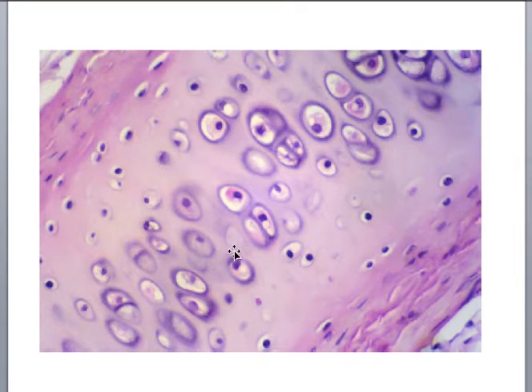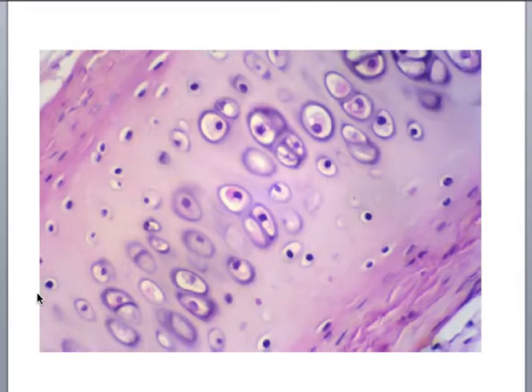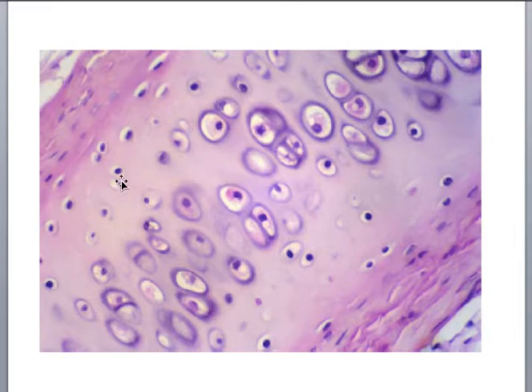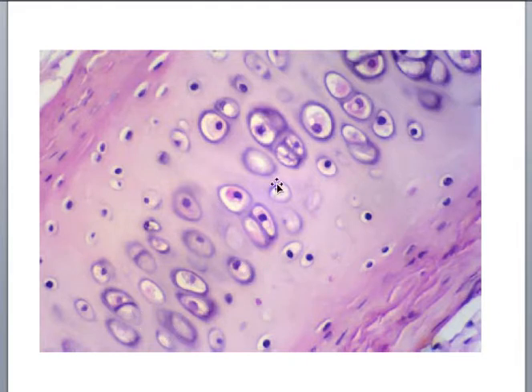This is another image of hyaline cartilage, and this is why you can't always learn by color or stain — because the stains and colors can vary, but the structure is not. Here are our chondrocytes in their little lacunae. If we could go in and out of fine focus, this extracellular ground substance would be very, very glassy in appearance. On the outside is that vascularized connective tissue — the perichondrium. All the structures are the same; the colors are slightly different. Usually no one gets hyaline cartilage wrong — it's pretty easy. The specific is hyaline cartilage; the general is connective tissue.